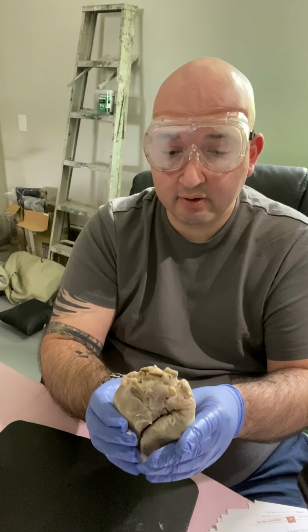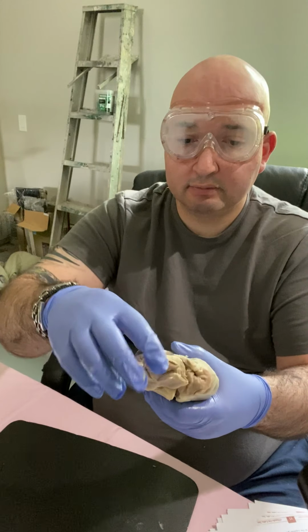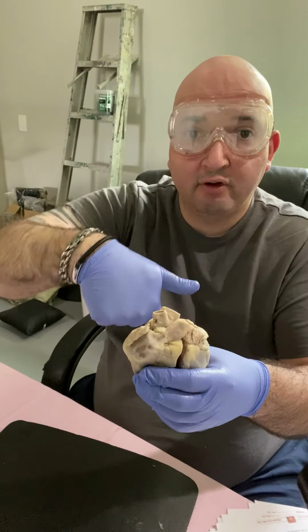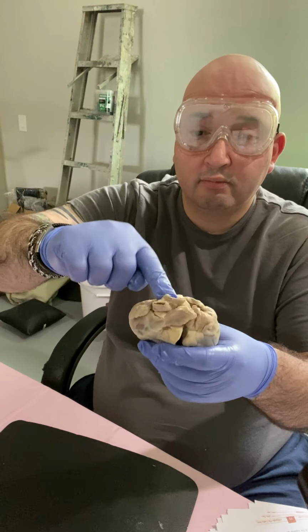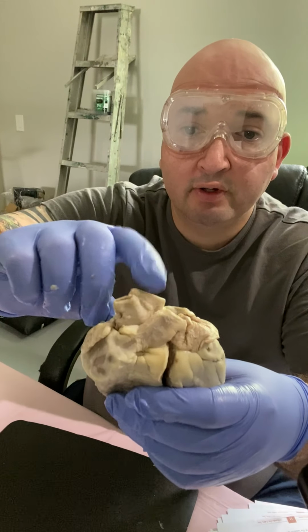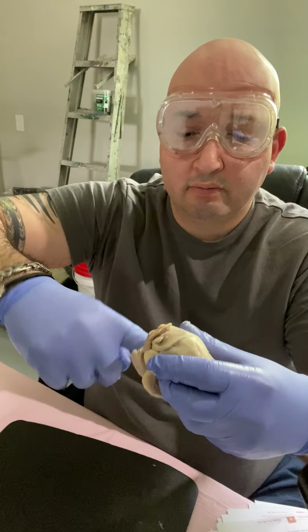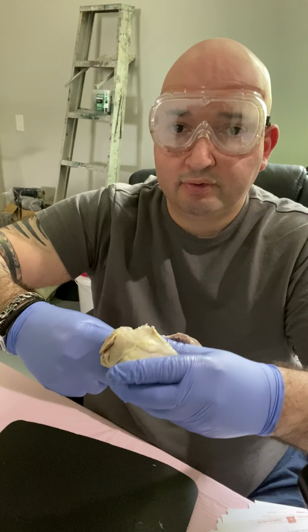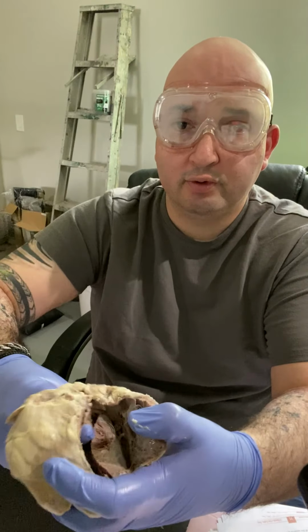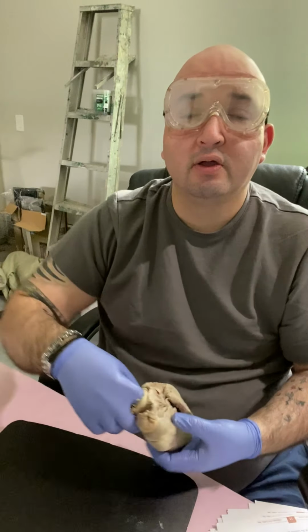So my vena cava on this diagram is this portion here. Superior, of course, means up, inferior means down. So this portion here is my superior vena cava, and then I'm going to put my finger in, and then you'll see where it pops through the heart. Hopefully you can see my finger in there. That's the inferior vena cava.